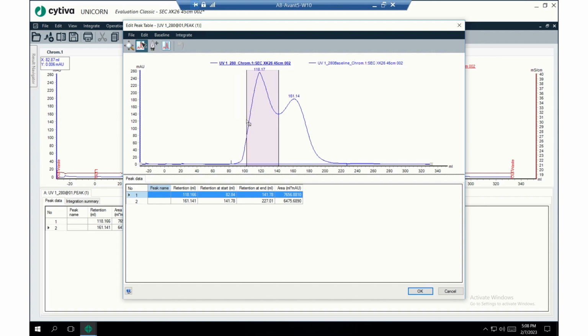And the fun thing is that there's no number, right? I also can't type in the number where I want it to start. So I know I wanted it to be like 103, I think 106, but I know this is a little bit more than 100 right now, but I'm not sure where it's at. Okay, and then I know I want this for this peak. Again, it's all the way out here. I want it to be 176, so I know it's got to be less than 180, but there's no numerical value expressed. So we'll try there.